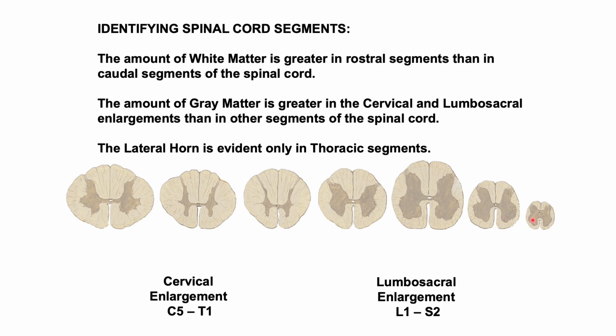from the sacral. So this will be lower sacral, this will be upper sacral, that close to the lower lumbar, and then you have upper lumbar, then the uppermost portion of the lumbar, and then that will be thoracic because of the presence of the lateral horn. You can also see portions of the lateral horn, so these two will be thoracic.